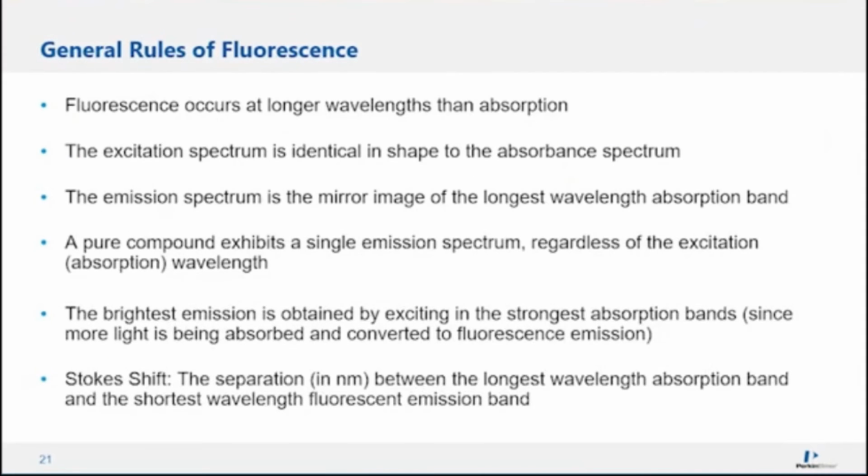Some of the general rules that we want to keep in mind for fluorescence are that fluorescence occurs at longer wavelengths than absorption. The excitation spectrum is identical in shape to the absorbance spectrum. The emission spectrum is the mirror image of the longest wavelength absorption band. A pure compound exhibits a single emission spectrum, regardless of the excitation wavelength.